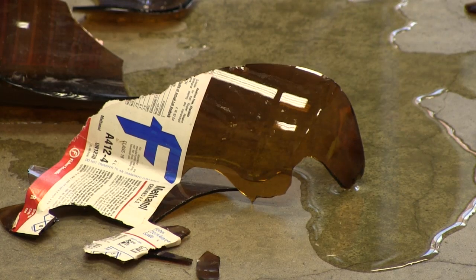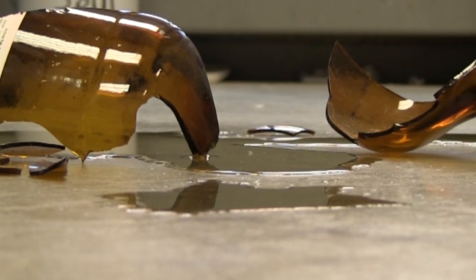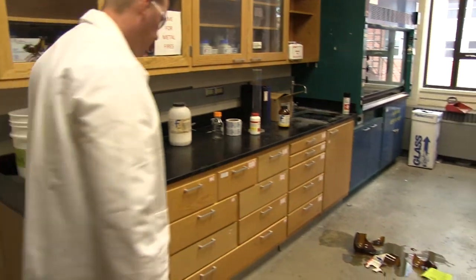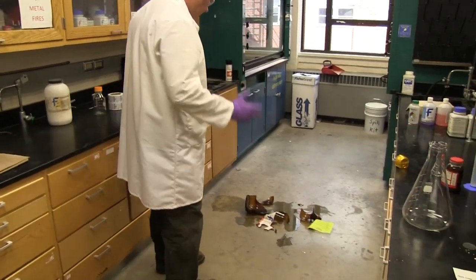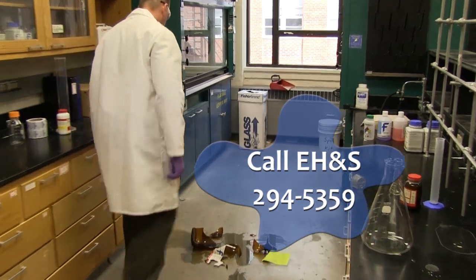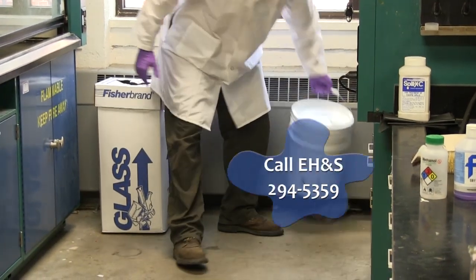Since you have user knowledge of the spilled material, you know that there are no significant hazards present and you have the appropriate training to clean up the spilled material. If you didn't have user knowledge of the spilled materials, you would want to consult a safety datasheet for proper spill cleanup procedures. Please contact EH&S at 294-5359 if you don't feel comfortable addressing the spill on your own.